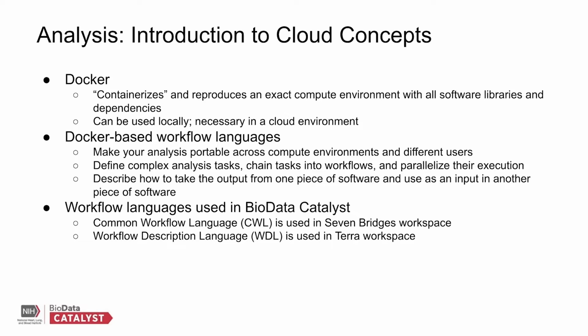So you'll basically define complex analysis tasks that have been potentially written in R, Python, or Bash, and you can chain those tasks into workflows and parallelize their execution. So this basically means that we can describe how to take the output from one piece of software and use it as input into another piece of software.